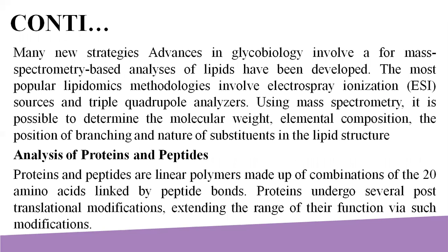The most popular lipidomics methodologies involve electrospray ionization, that is ESI source, and triple quadrupole analysis. Using mass spectrometry, it is possible to determine the molecular weight, elemental composition, and the position and nature of substituents in the lipid structure.